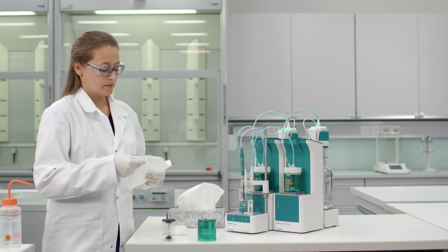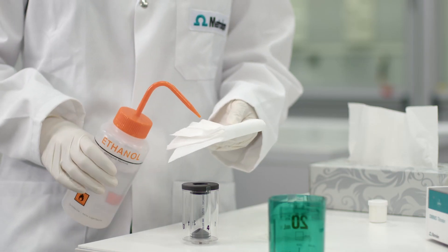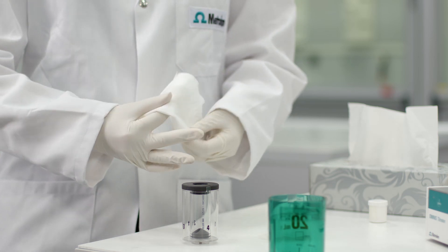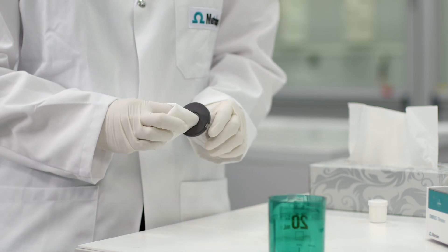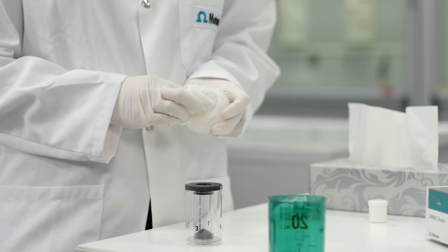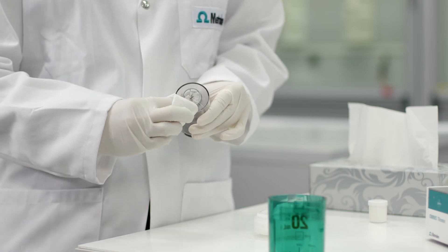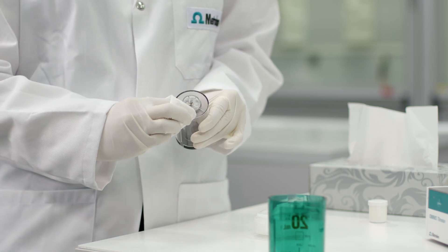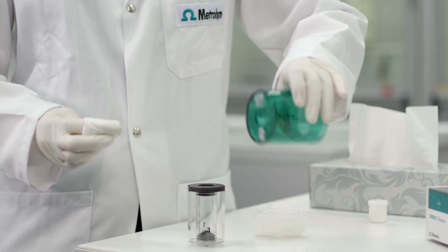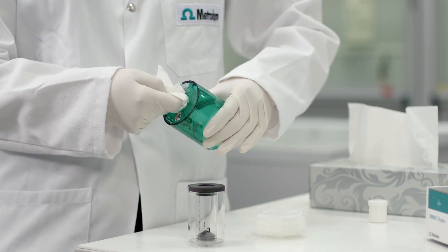Now I will show you how it is done. Take a soft tissue moistened with ethanol and wipe these parts: valve disc, distributor, centering tube, and inside of the housing to remove any particles or precipitants from your titrant.